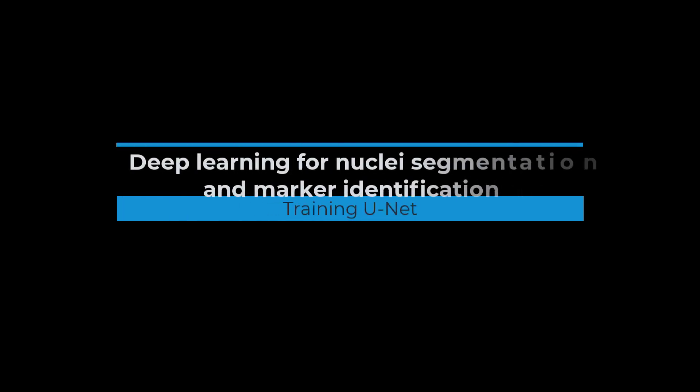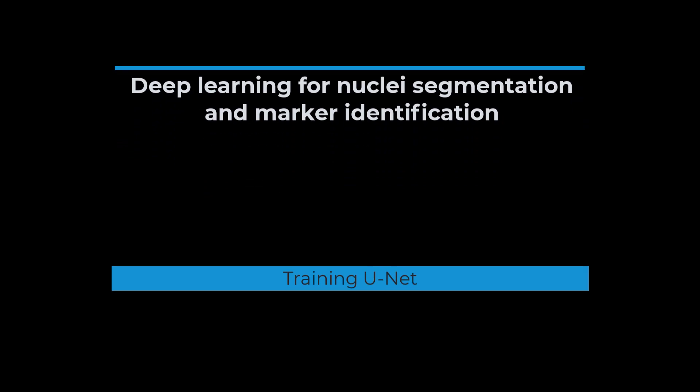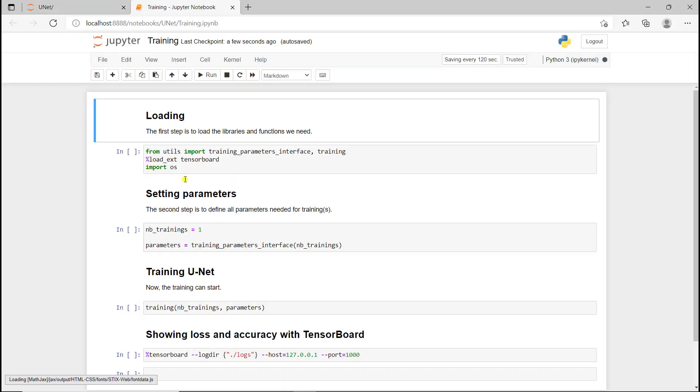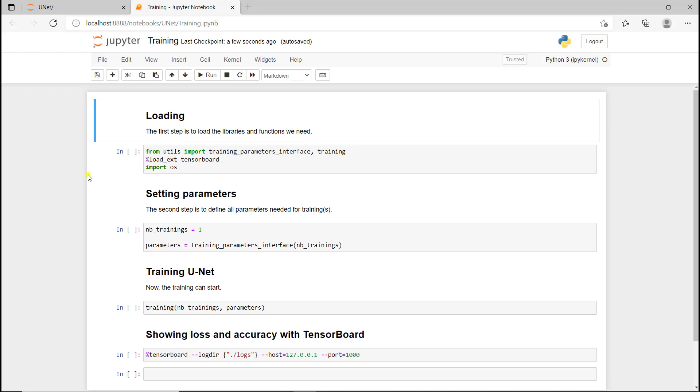In this video I'm going to show you how you can train a U-Net model for nuclear segmentation. First I'm going to open the notebook entitled training, and with all the codes that come in this GitHub folder, they're all organized the same way.